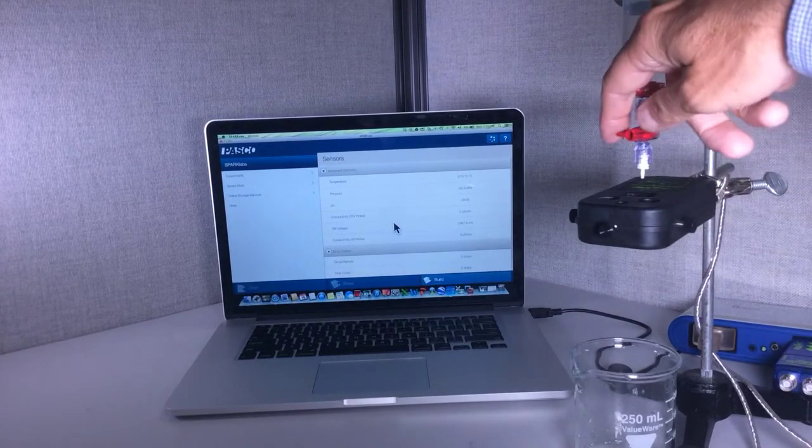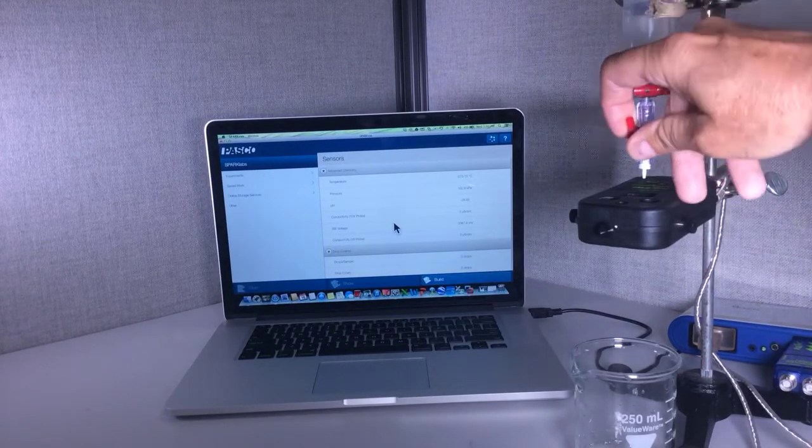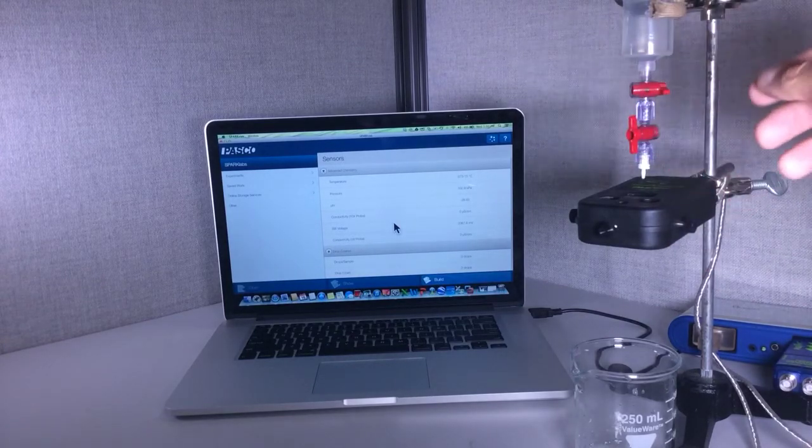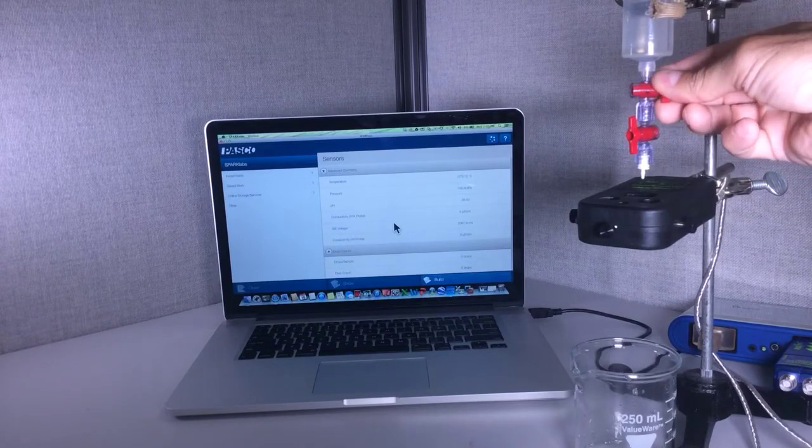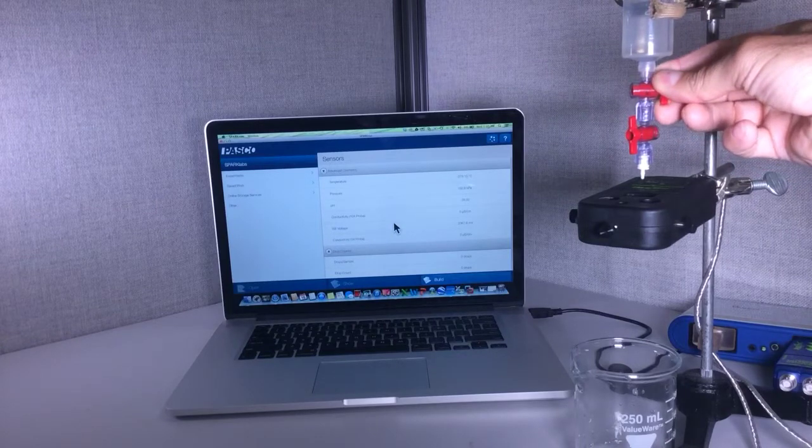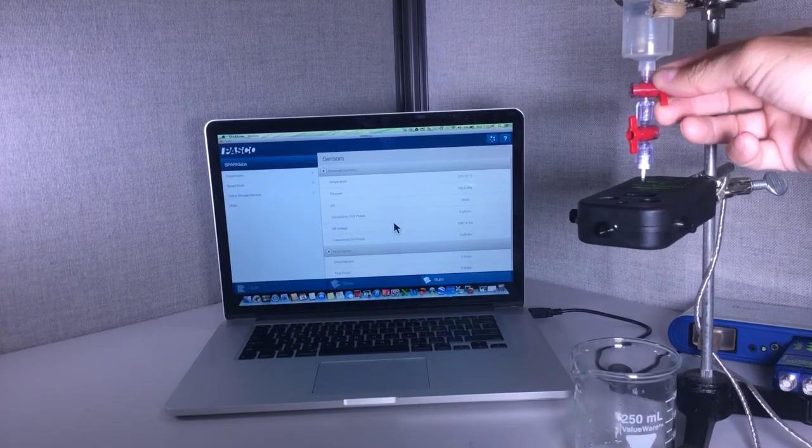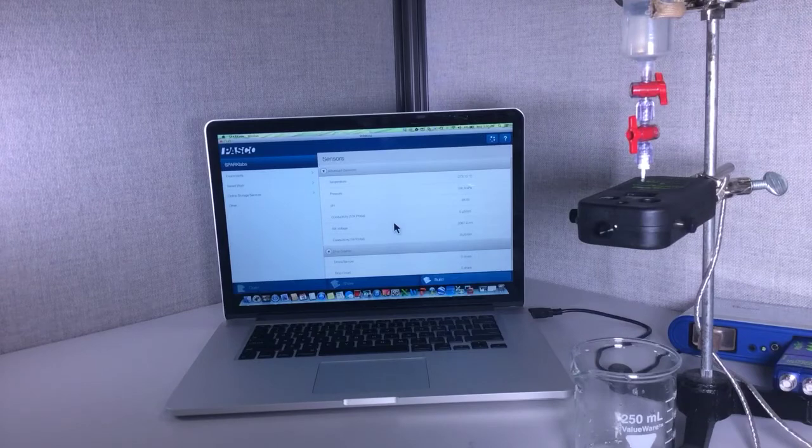What I'm going to do is turn the bottom one on completely and then adjust the top one until I get a nice steady flow. That looks pretty good.